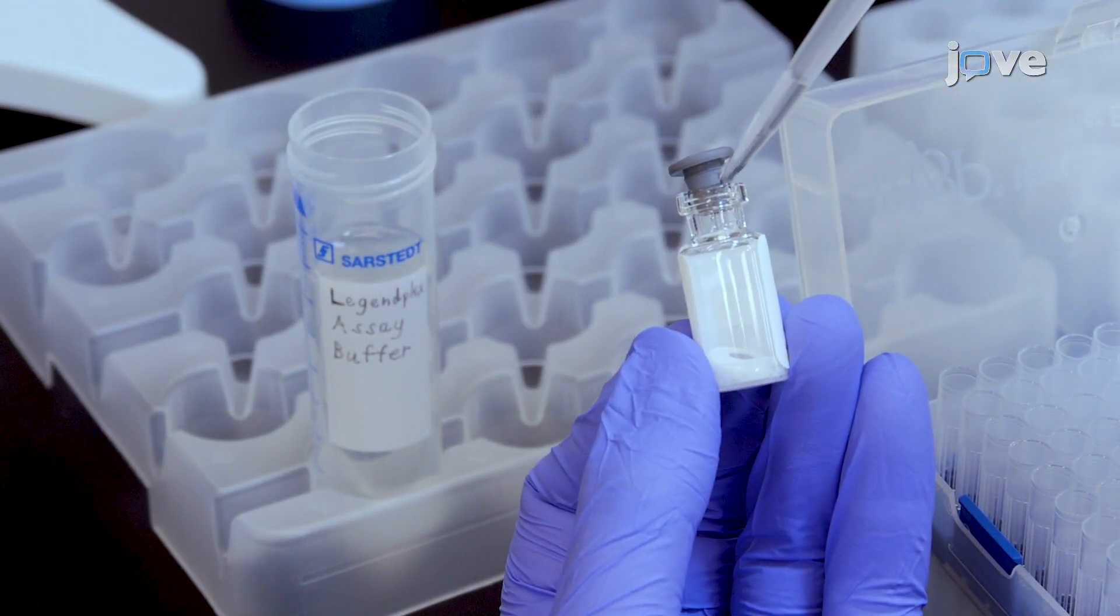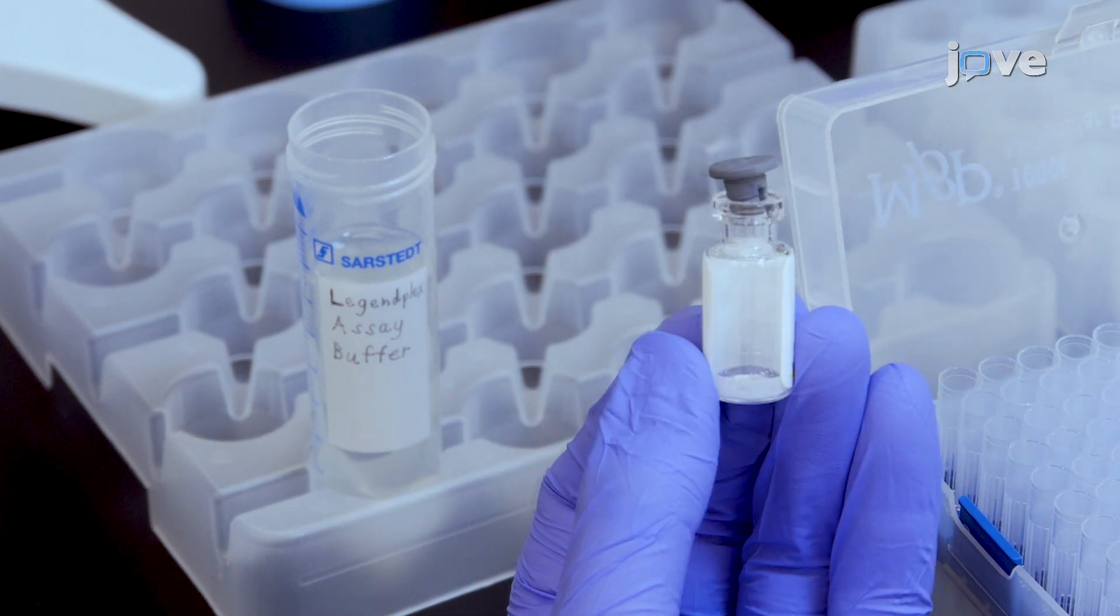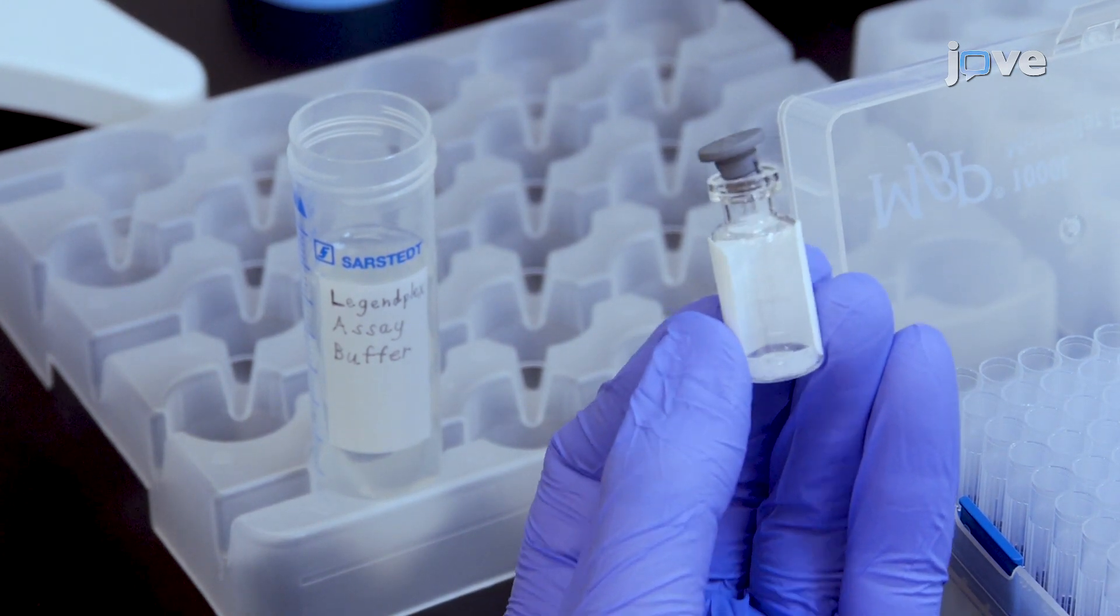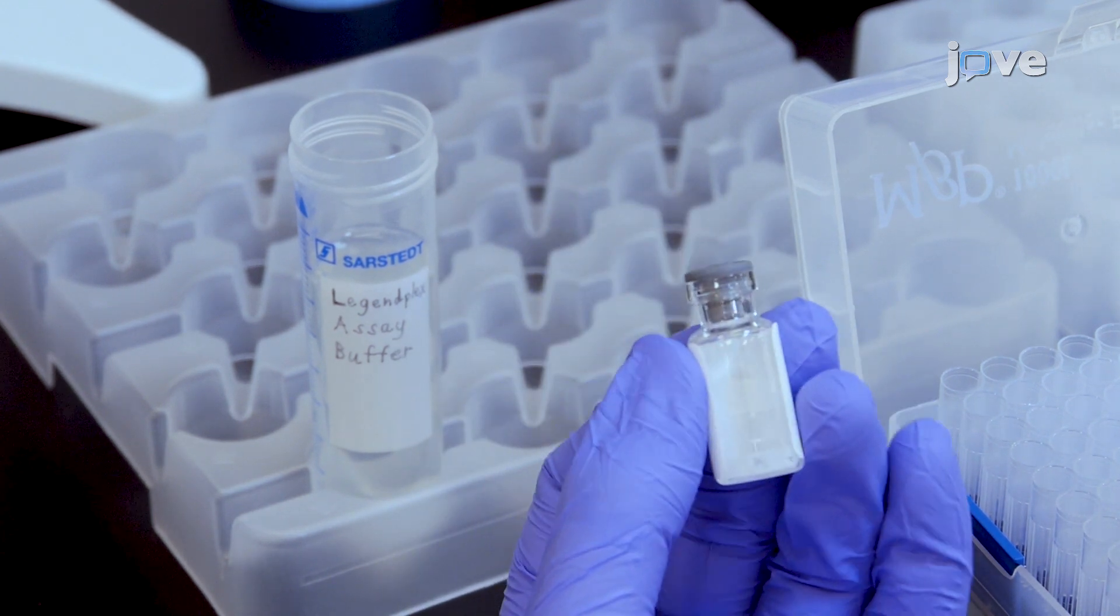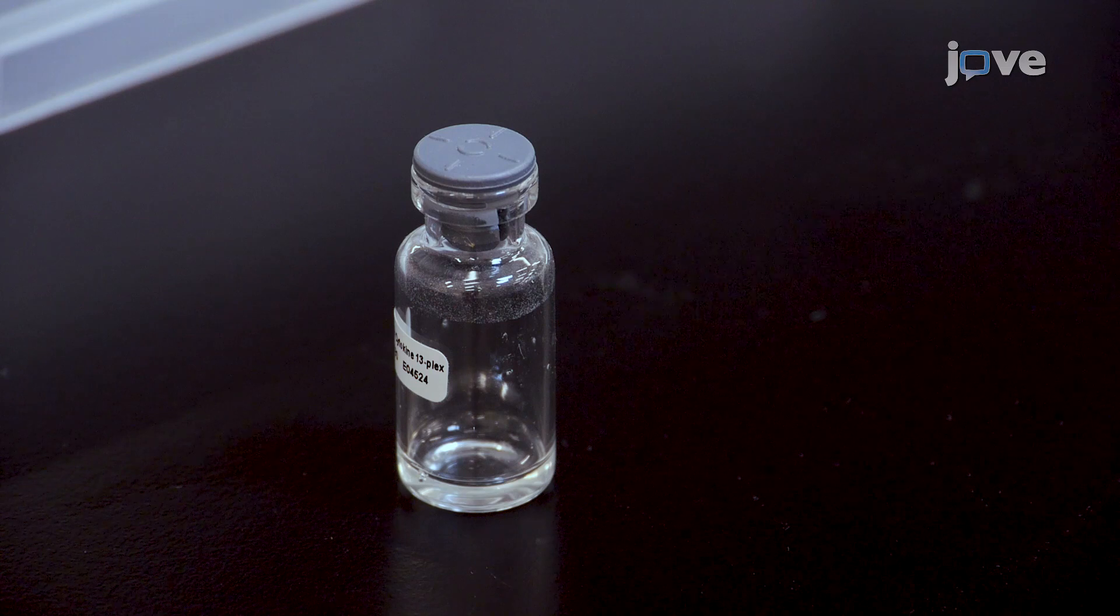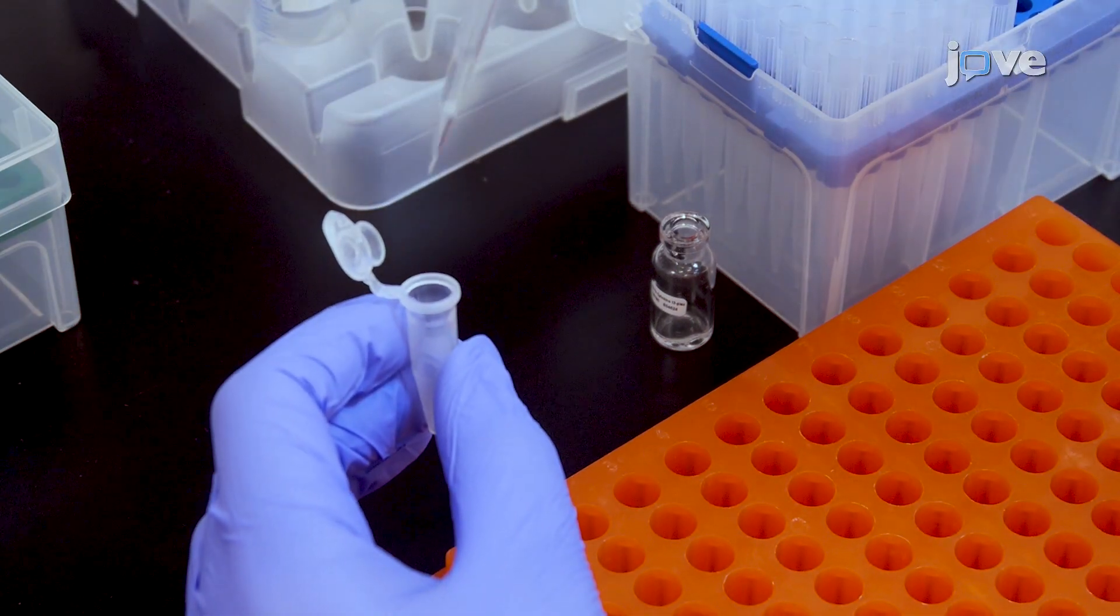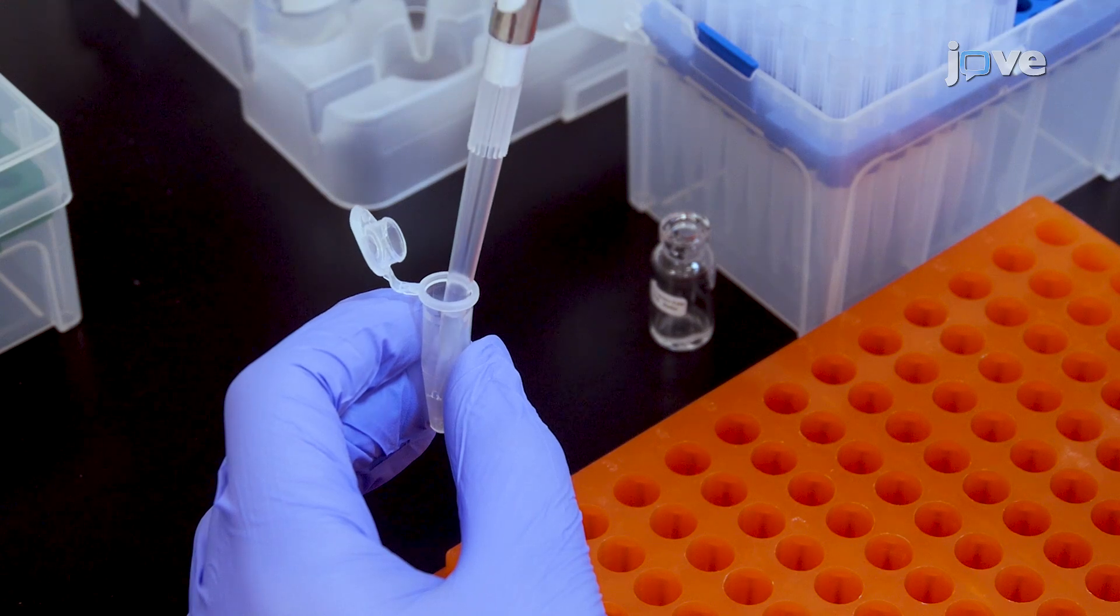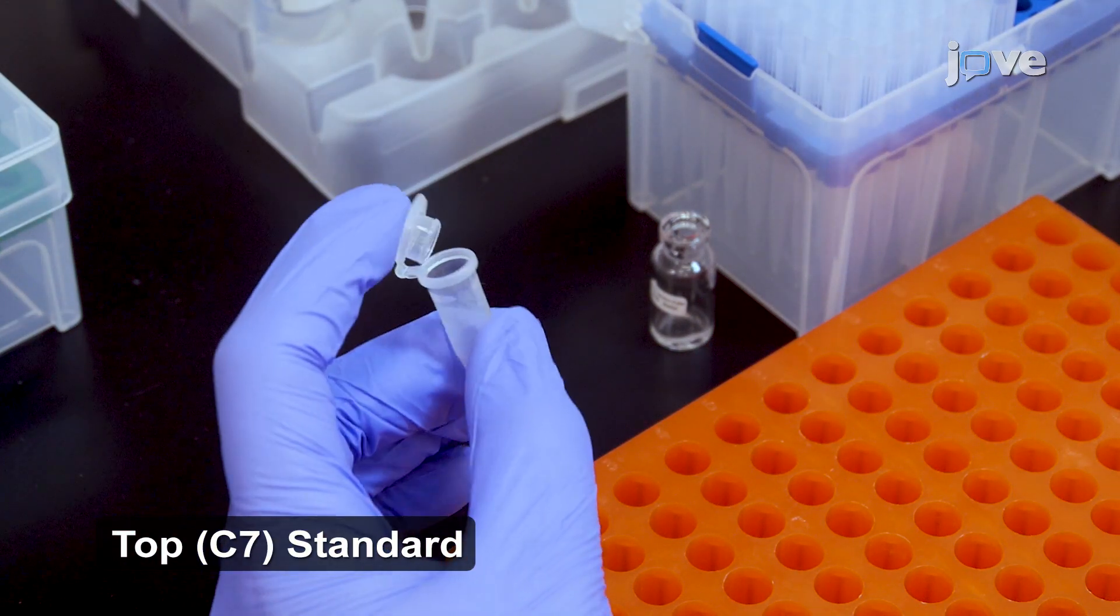For standard preparation, add 250 microliters of assay buffer to reconstitute the lyophilized mouse TH cytokine standard cocktail. Mix by briefly vortexing and allow the vial to sit at room temperature for 10 minutes. Transfer the standard cocktail to a polypropylene microcentrifuge tube labeled C7. This will be used as the top standard.